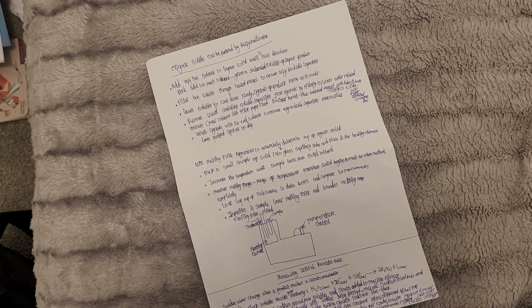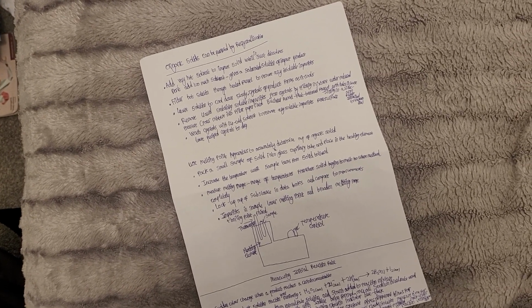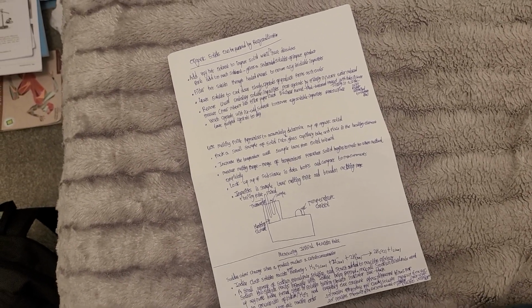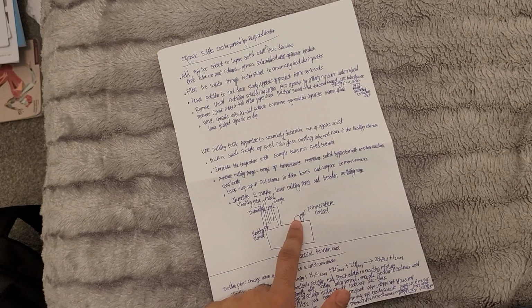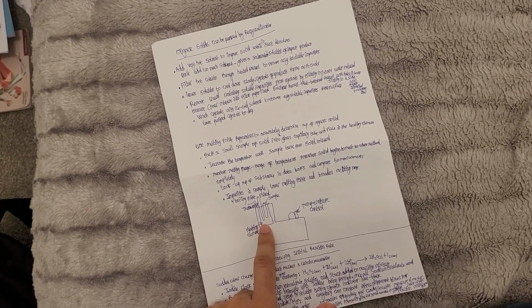Impurities in a sample lower the melting point and broaden the melting range, and they increase the boiling point. So the boiling point will be raised, the melting point lowered, and the melting range broadened. And here's the equipment. So you've got a thermometer, that's your sample, and a temperature controlled heating element, which increases the temperature until the sample turns from solid to liquid.